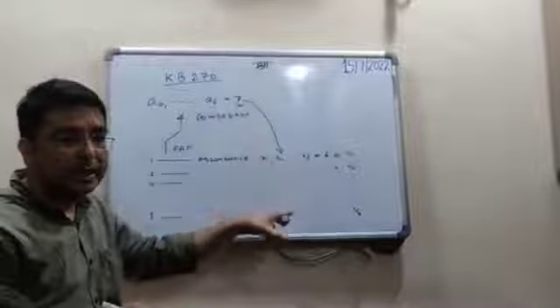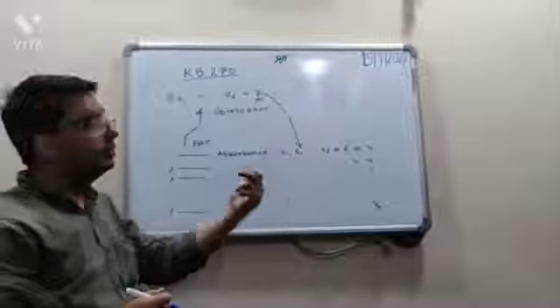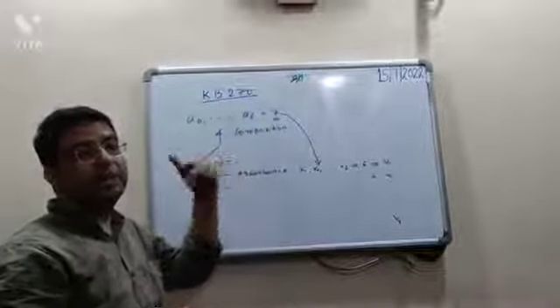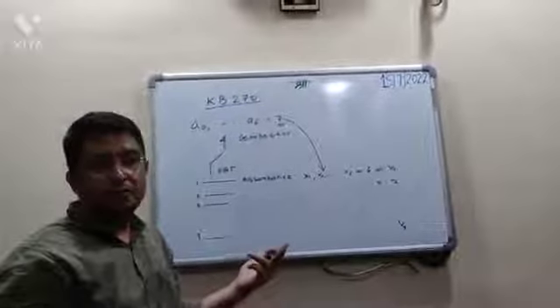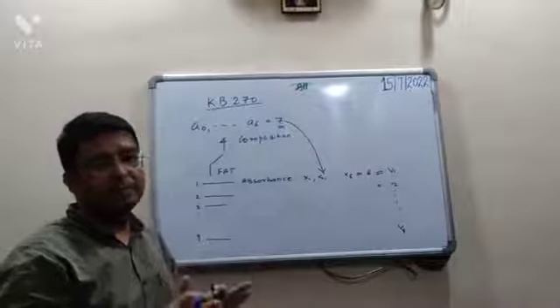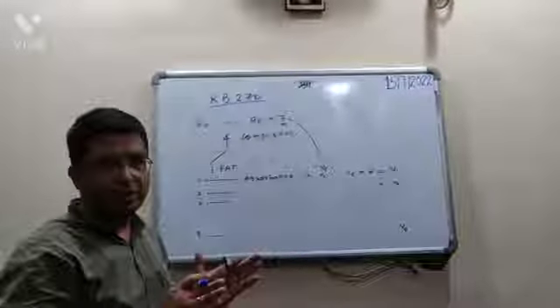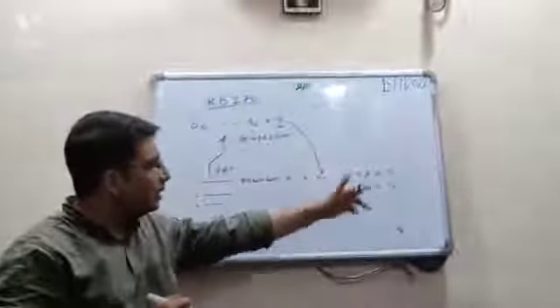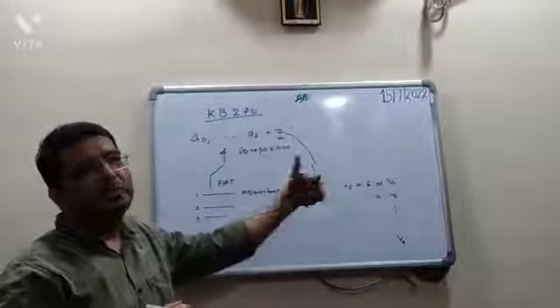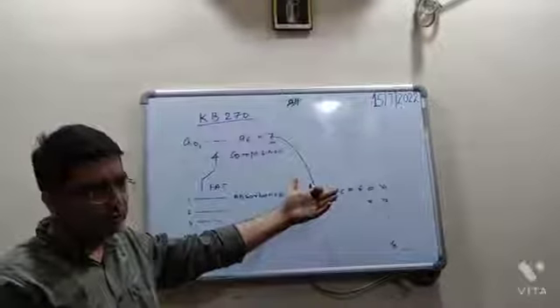So how many values are there? 9 values of actual fat, but calculated by the instrument. So we cannot say that it is correct. It may not be. You're getting my point or not? So these V1, V2 up to V9 are what you can call the actual values.